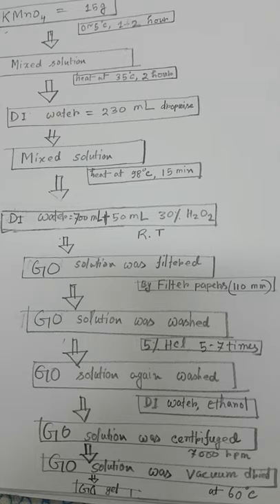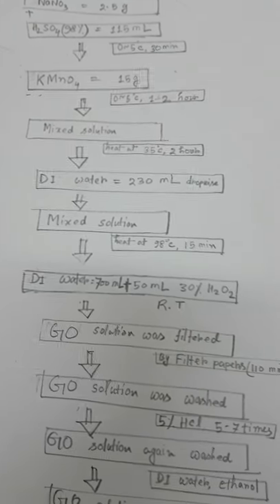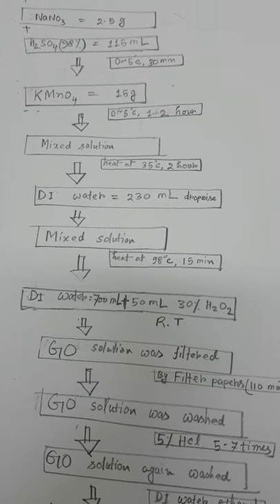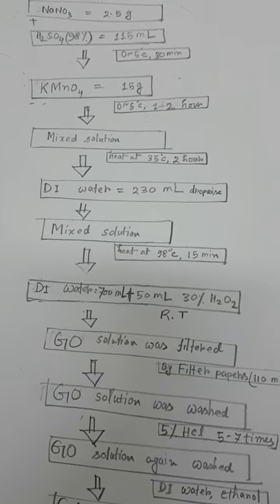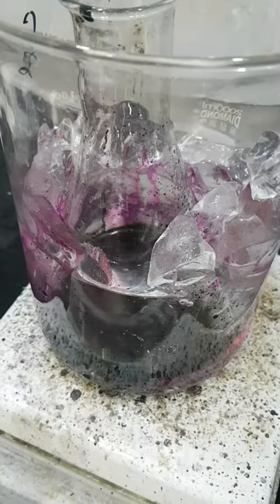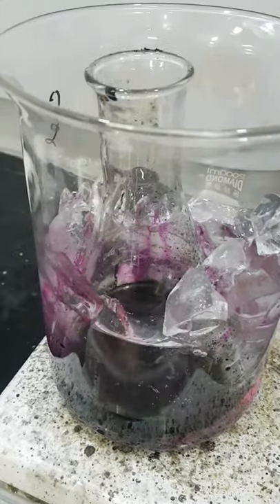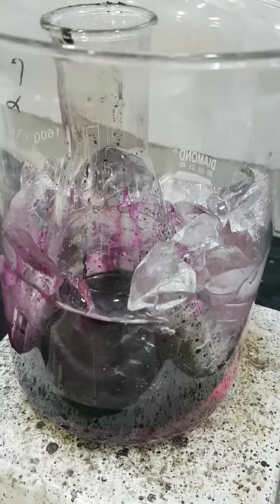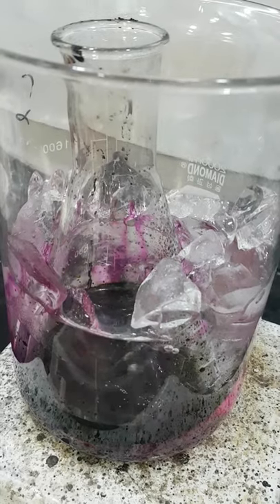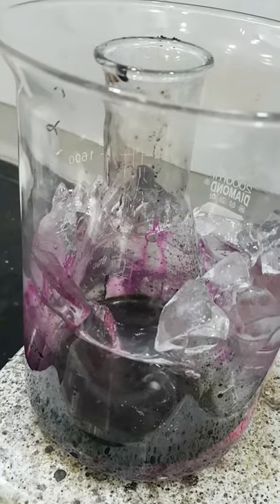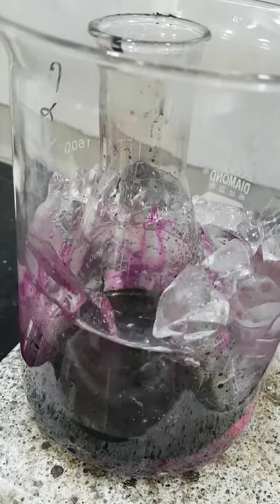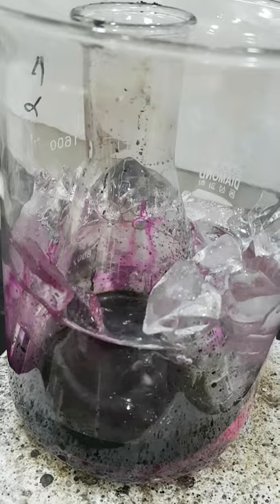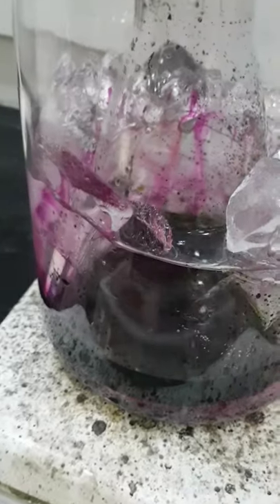Now I'm showing practically how I synthesize graphene oxide by the modified Hummers method. So here the reaction is going on. I made a beaker and put it down on ice so that I can maintain the temperature. I measure the temperature with a thermometer.